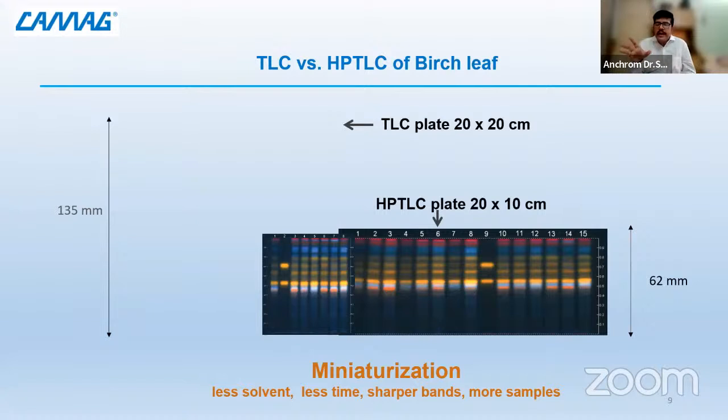With most analytical people, this becomes really challenging, because they are not able to perform it in the same unit time, either because of the cost or because of the time. But HPTLC solves this, because whether you are at a screening step or the quantification step, you can use this and utilize it in a fantastic way to get the output in very short time. So analyzing a lot of samples is never a problem. The economics is cheap, and the time consumption is less. So both advantages are there, and that becomes one of the better choices for the analytical world.